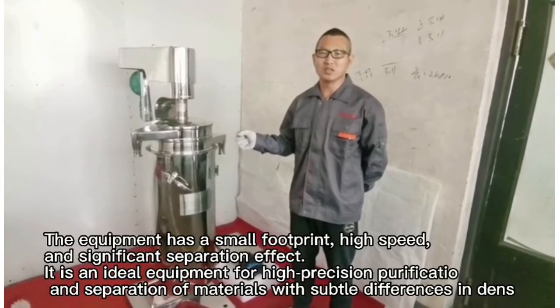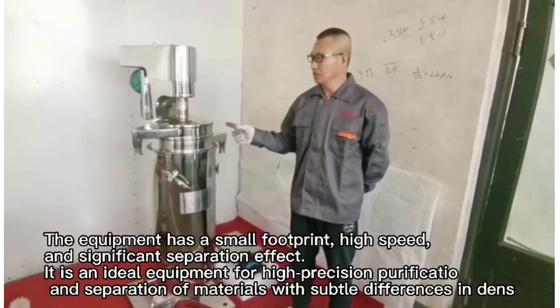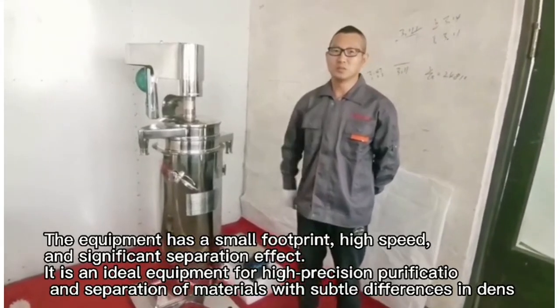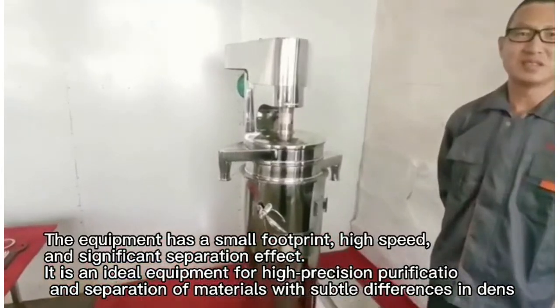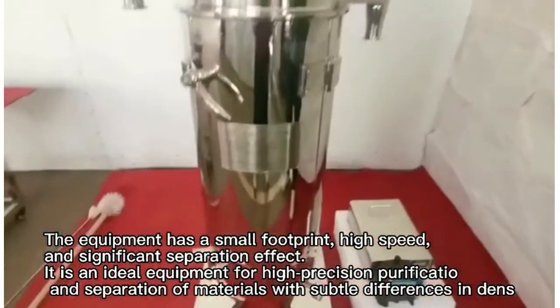The equipment has a small footprint, high speed, and significant separation. In fact, it is an ideal equipment for high-precision purification and separation of materials with subtle differences in density.